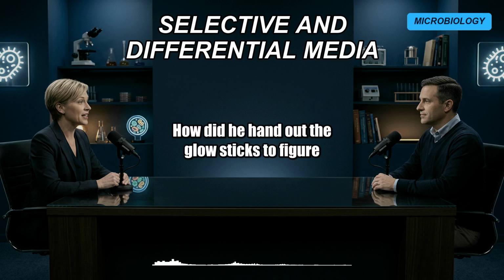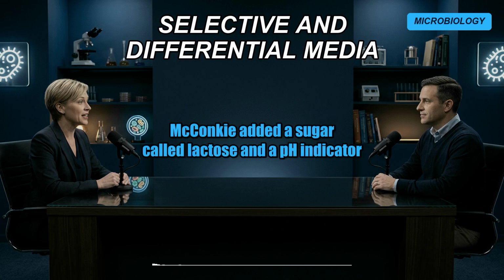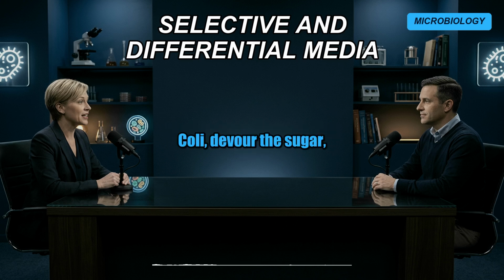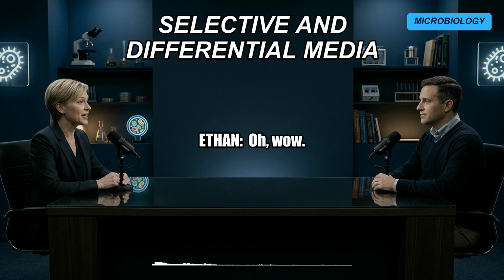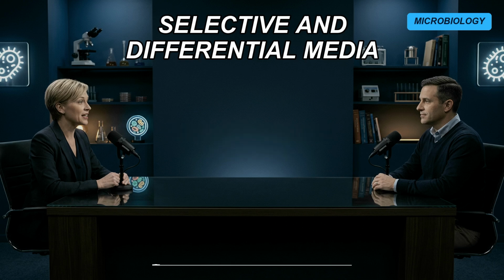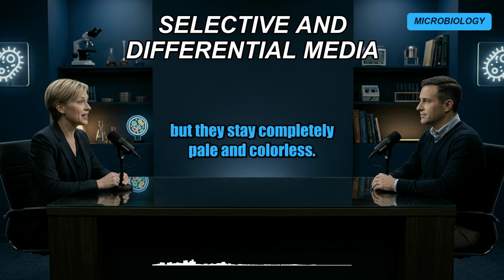How did he hand out the glow sticks to figure out which gut bacteria was which? For the glow stick, MacConkey added a sugar called lactose and a pH indicator called neutral red. Lactose, like in milk. Right. Lactose-fermenting organisms, such as harmless strains of E. coli, devour the sugar, they pump out acid, and they turn the neutral red dye into a vibrant pink or magenta. Oh, wow. However, dangerous non-fermenters like Salmonella or Shigella lack the enzymes to eat lactose. They grow happily on the plate because they survived the bile bouncer, but they stay completely pale and colorless.